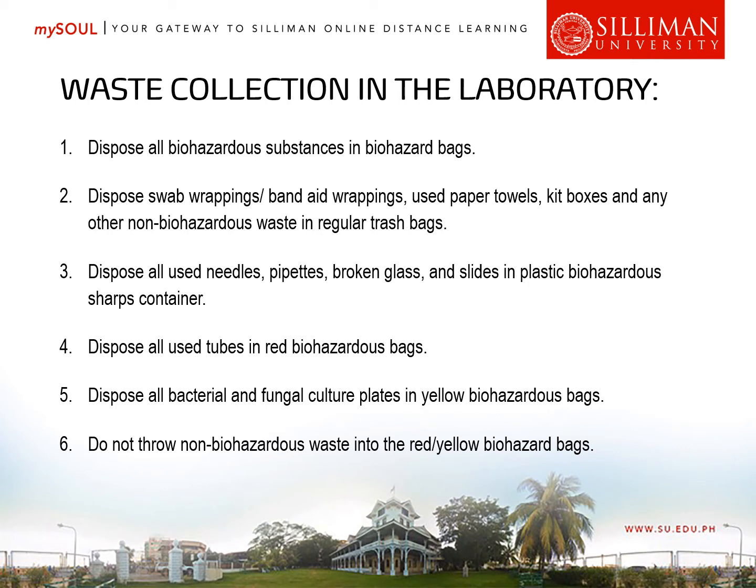Number three, dispose all used needles, pipettes, broken glass, and slides in plastic biohazardous sharps container. Usually, it's a red colored waste container for the sharps. Number four, dispose all used tubes in red biohazardous bags. Number five, dispose all bacterial and fungal culture plates in yellow biohazardous bags, because our bacterial and fungal culture plates are pathological waste or infectious waste. They have the capacity to transmit or cause infection to other humans or animals.